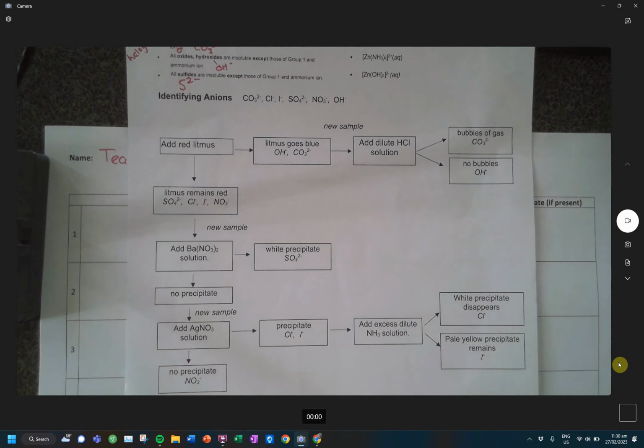Other things I will need will be test tubes. That way I can do that reaction. Just grabbing a handful. And I will need a test tube rack to make my life easier. For the litmus paper, I don't want to be shoving litmus paper down my test tube and then having to get it out. So I'm grabbing a paper towel so I can drop my unknown solution on there. And let me grab my unknown solution as well.